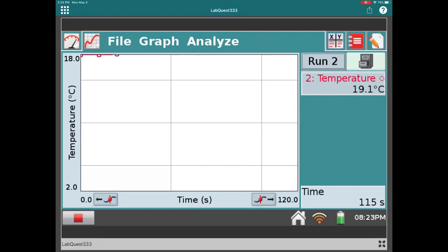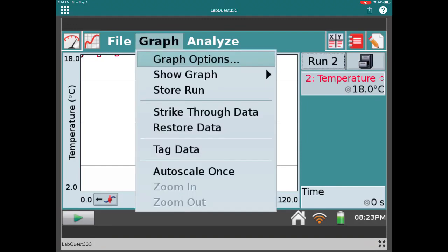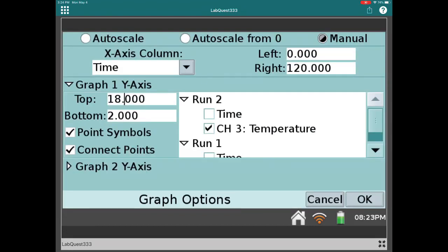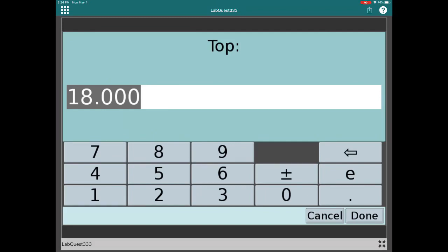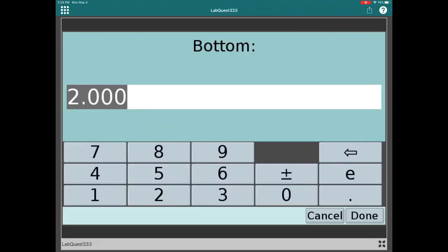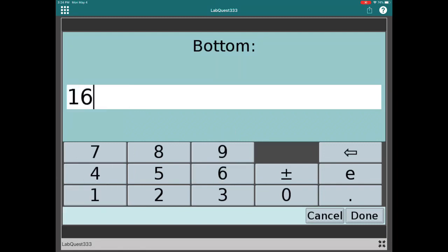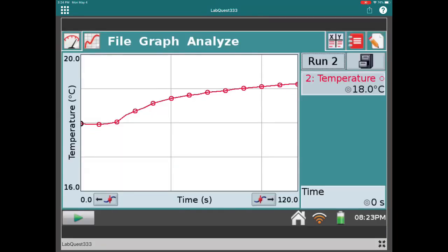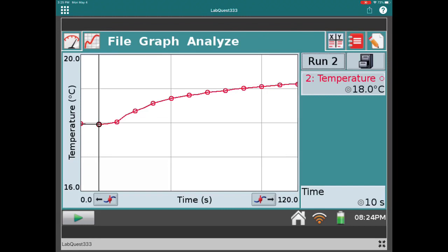There's our last data point recorded. Let's click on the graph options and change the maximum temperature to 20 degrees Celsius and the lower temperature to 16 degrees Celsius — so from 16 to 20. You can see on the left that the temperature began at around 18 degrees and then rose throughout the experiment instead of dropping. The final temperature was 19.1 degrees and the initial temperature was 18.0 degrees. Can you rationalize what happened here?